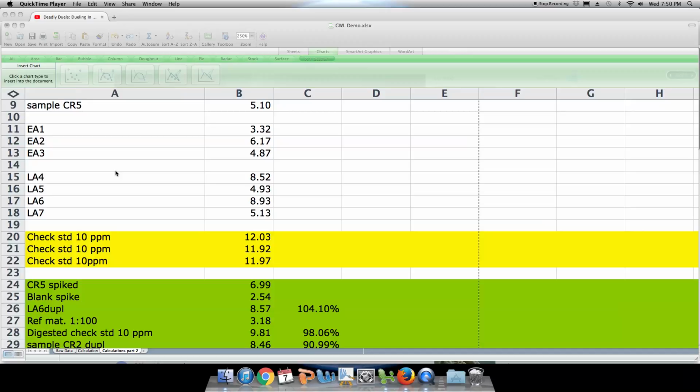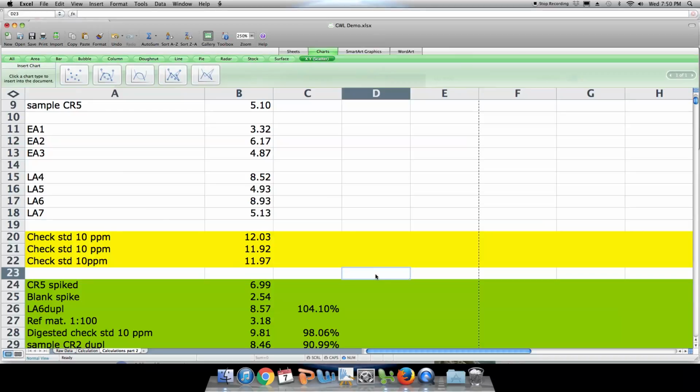So rather than add the 8 milliliters in for the purposes of our calculation, and then have to subtract the 8 milliliters out, we just ignore that 8 milliliters and treat everything as being made up in 16 milliliters.